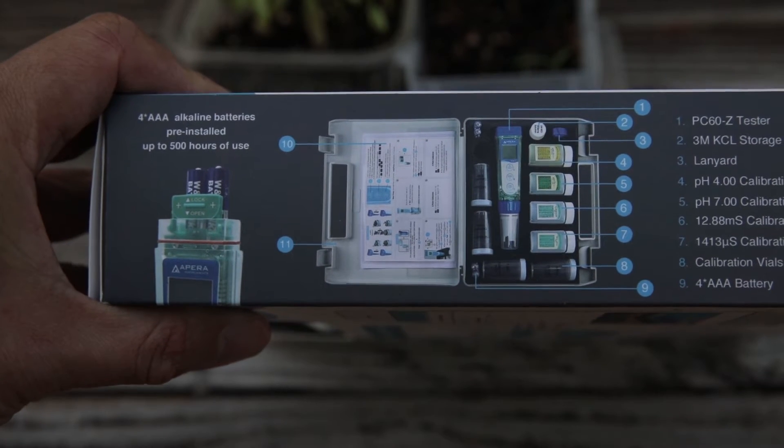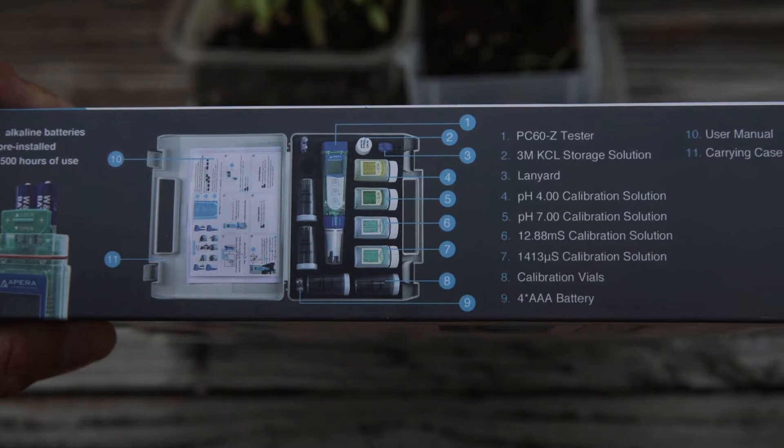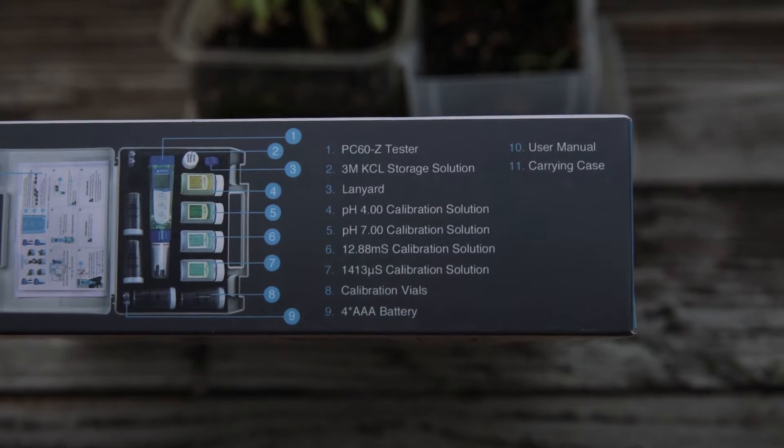On the other side you'll see that the four AAA batteries will give up to 500 hours of use, in addition to all the other accessories that are included with your kit.